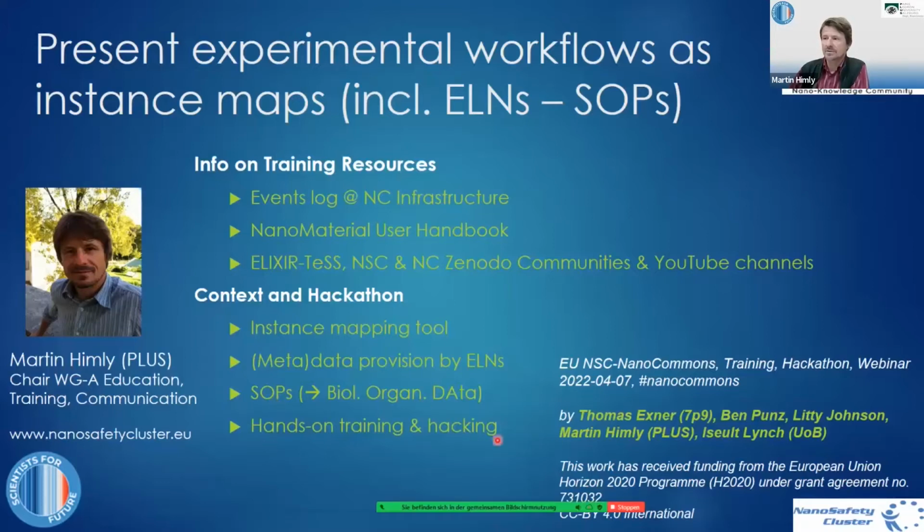We are going to keep this quite hands-on, and we are going to show you, and you can also interactively together with us and ask back to us, do some instance map establishments or developments for your specific experimental workflows.